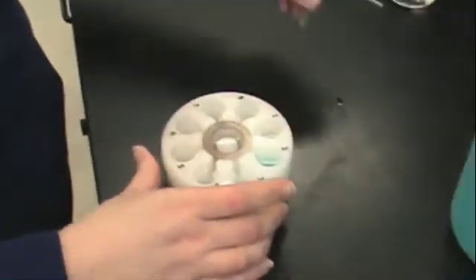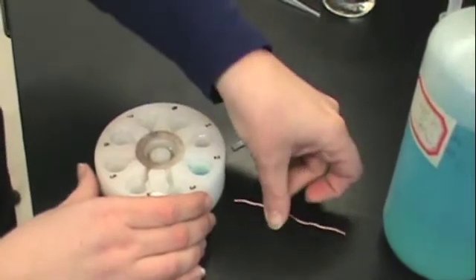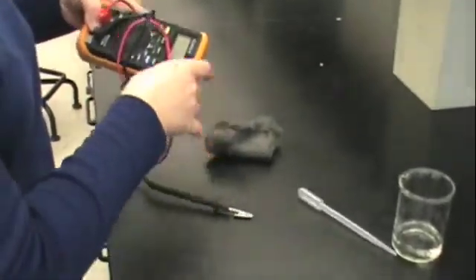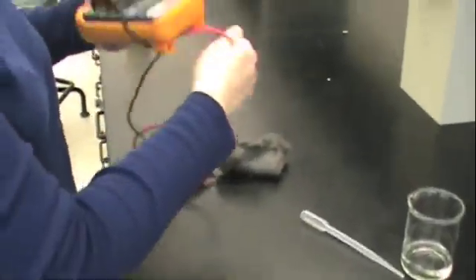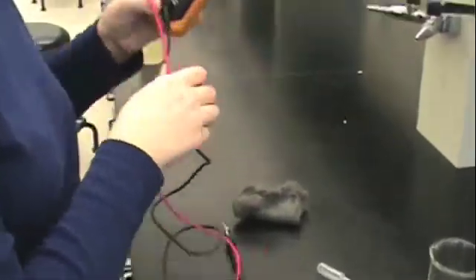Now you will need your metal pieces. The zinc is the flat long piece and the copper is the copper-colored piece. Make sure that your zinc piece doesn't have any corrosion on it — you can use your steel wool to brush it lightly before performing the experiment.